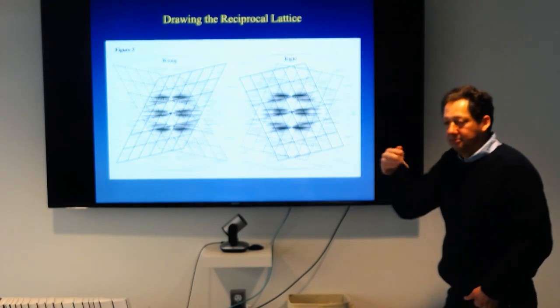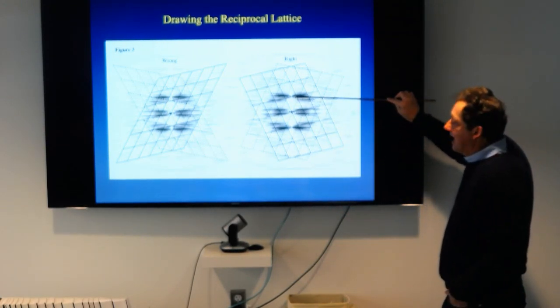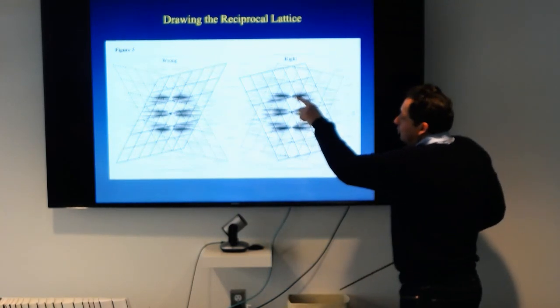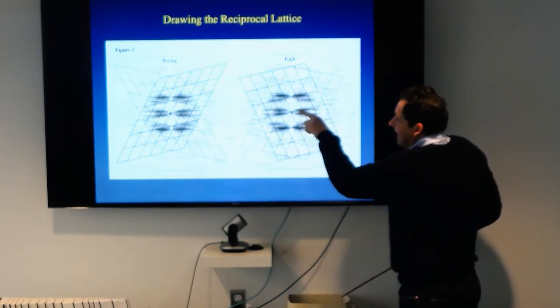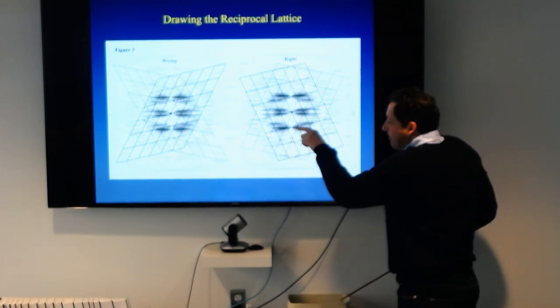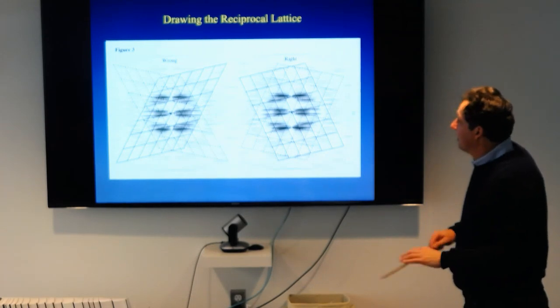So when you start to do it, the first thing you have to do is make sure the height is right. You have to find a lattice in which you can see nicely all the major points being intersected by points in your lattice.